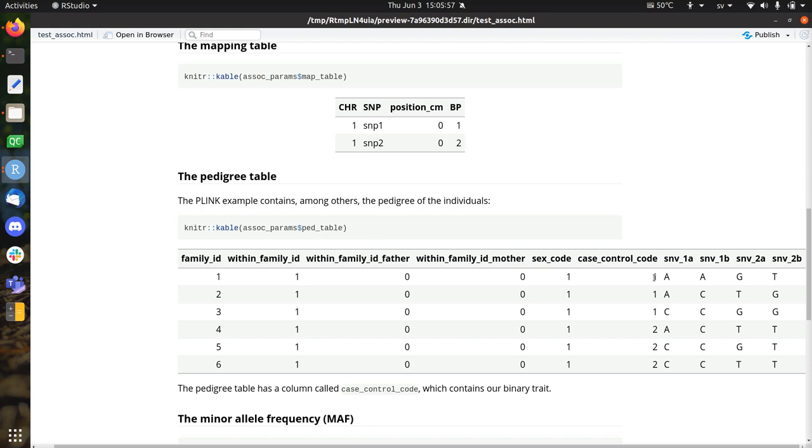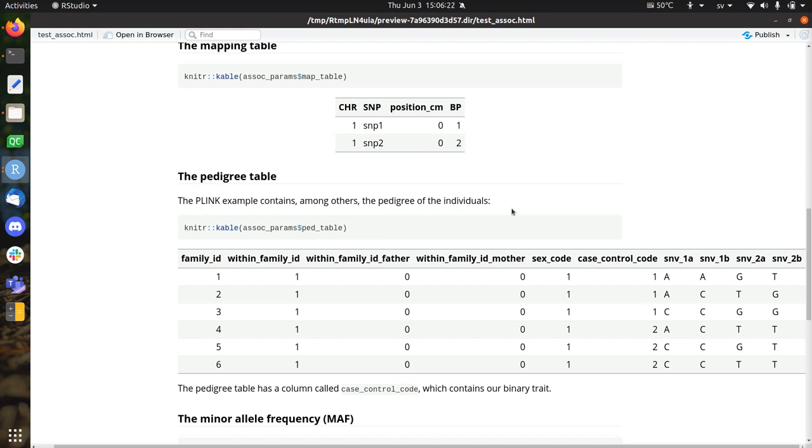This is the phenotype, the case control code. I think one is the case, two is the control. That's irrelevant for this video, but one of the two is the case, one of the two is the control. And these are the genotypes. So we have snip 1, A and B, because it's a diploid organism, and snip 2, A and B, because it's a diploid organism. So this is also supplied by Plinkr 1.9. This is how it looks like. So this is all we base our analysis on. So that's not much, so don't expect a strong association here.